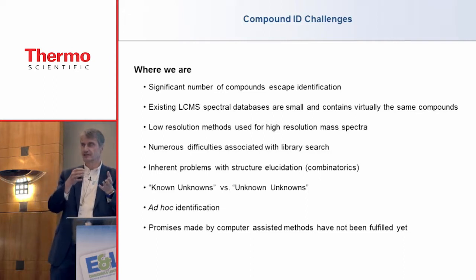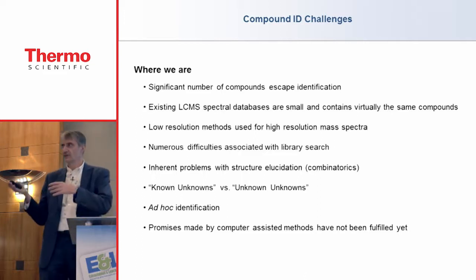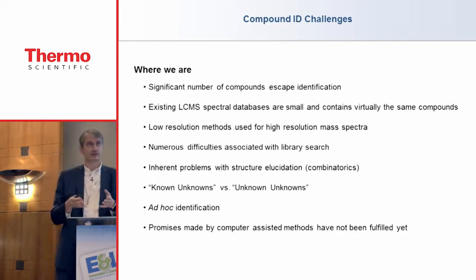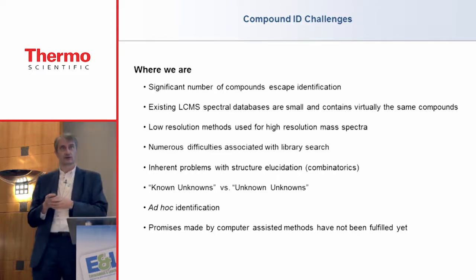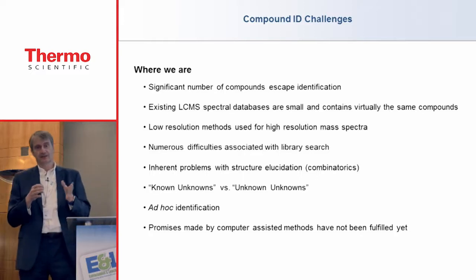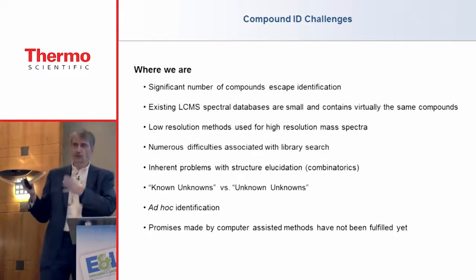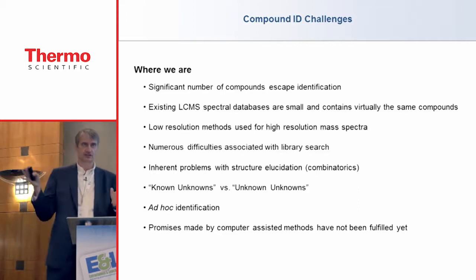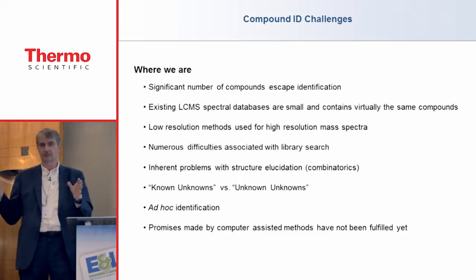There has been a mass spectrometer on Jupiter falling down, and a mass spectrometer on Saturn's moon, and so on. Why can we not identify the compounds on Earth? We have the sample, we have all these instruments, so why is it so complicated? I will try to explain why, but not make the already complicated story even more difficult. So I will only focus on LCMS. I will not touch other analytical techniques like GCMS or NMR or others.